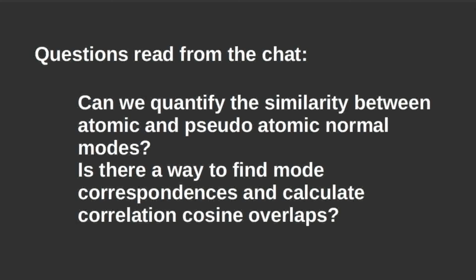For the first question, of course, that was done many years ago. There are some papers, I don't even remember if it was 2004, from Florence Tama. They have shown that pseudoatomic modes approximate atomic modes when, of course, the cutoff radius is well set up.